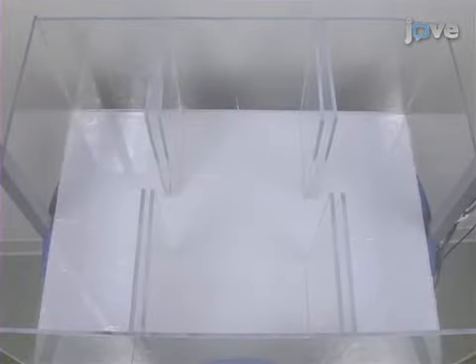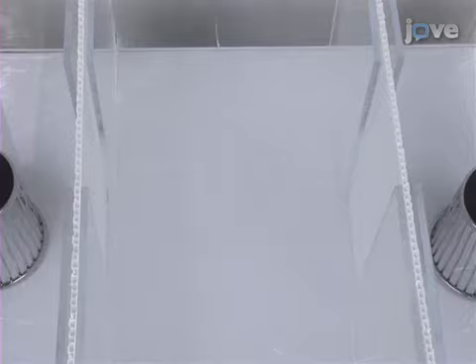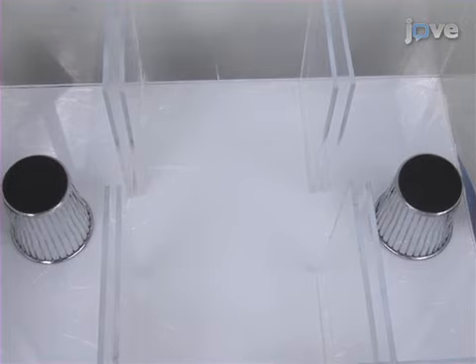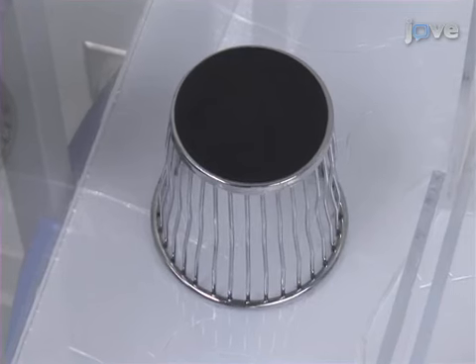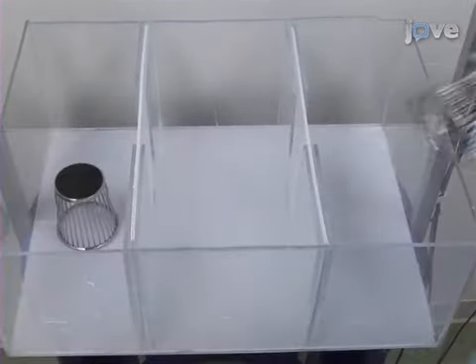Crawley's sociability and preference for social novelty test is conducted in a rectangular 3-chamber box. Each chamber measures 19 by 45 centimeters, and the dividing walls are made from clear plexiglass. The middle section opens to allow free access to each chamber. The wire cups needed for this procedure should be large enough to hold a single mouse and have openings that allow ample air exchange but prevent direct physical interaction. Place one cup into each side of the chamber.